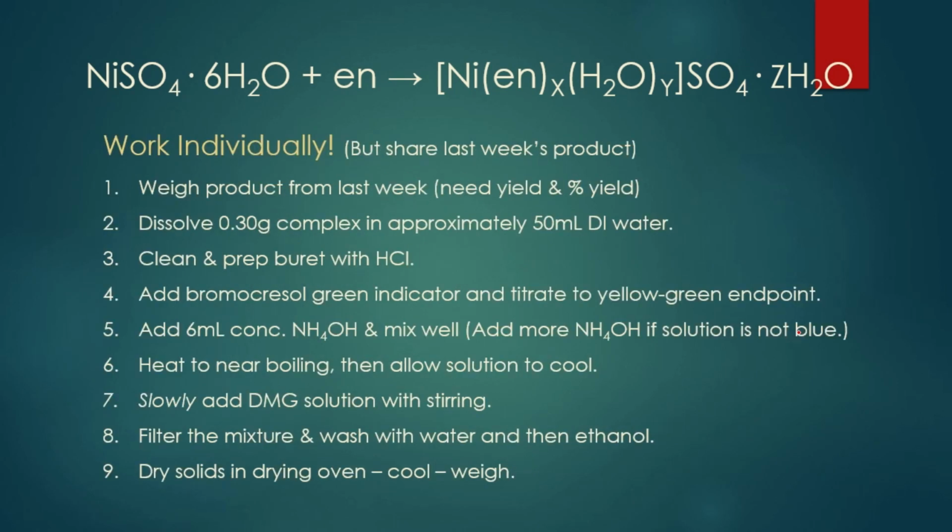So today's experiment, you're going to be working individually. Last week you worked in pairs to make the nickel ethylenediamine complex. You're going to share that. The stuff you made, you should have probably close to 2 grams of product. You only need 0.3 of a gram for this reaction, so you and your partner can each do 2 or 3 reactions with this without any problems. There's plenty of the material.